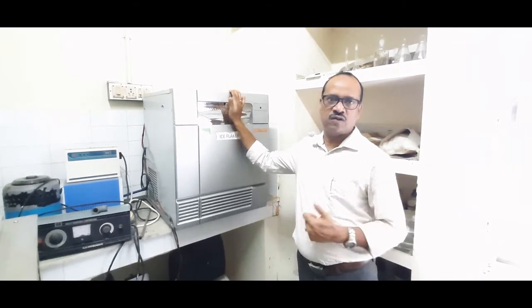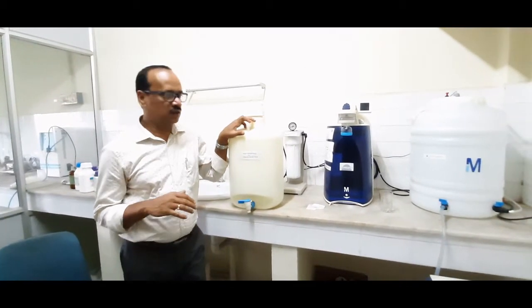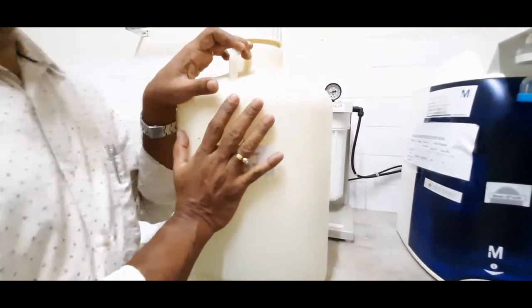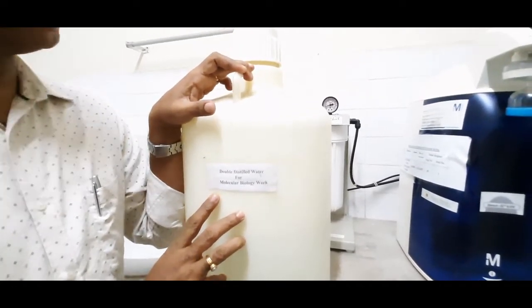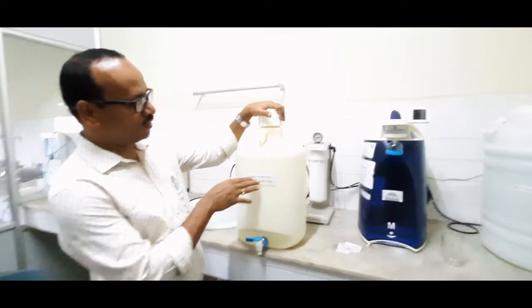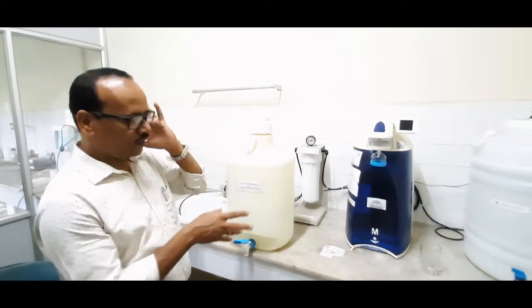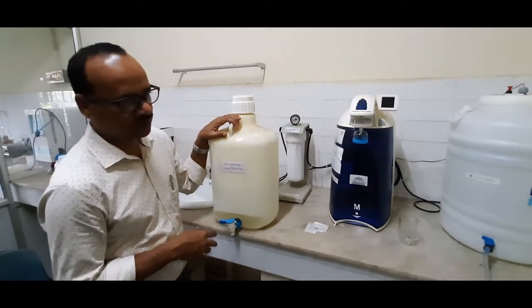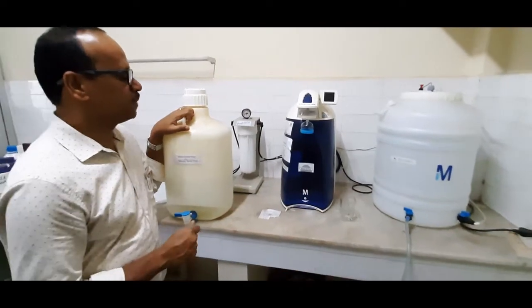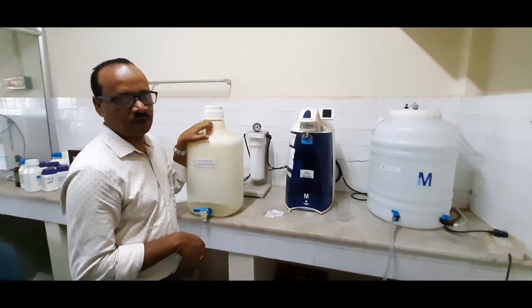All molecular biology work is done with molecular biology grade water — ion-free water. This is a Millipore grade one and grade two water generating equipment where you get two types of water: double distilled water and molecular grade water. For general preparations, chemical preparation, and gel preparation, you can use the double distilled water, and for PCR reactions, sequencing, and other molecular work, you use PCR grade water.